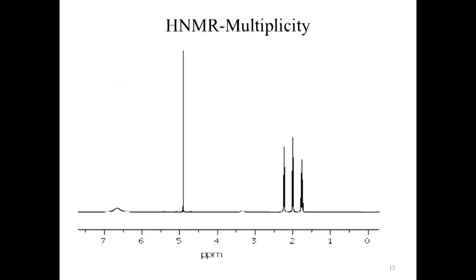Okay, hopefully you've had a chance to go through and look and decide how many peaks you've got. So let's take a stab at the first easiest ones. There's 1 peak. Not bad. This guy, also 1 peak. Now we've got a little bit of a tricky situation on trying to interpret this.